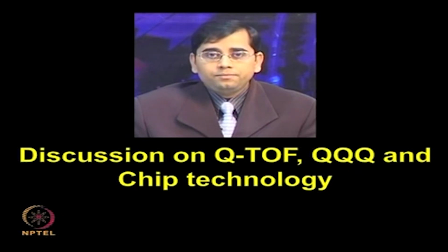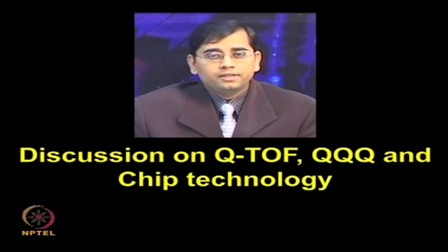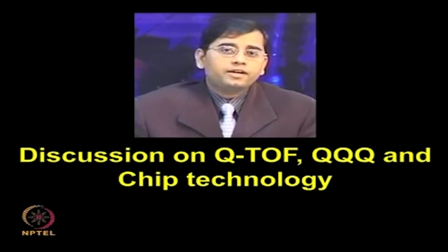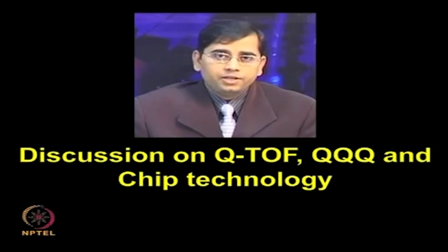So, I will discuss this with one of the leading application experts from Agilent, Mr. Abhijit, and during this short discussion and interview, we will try to provide you an overview of the different types of latest configurations available and what their advantages are.